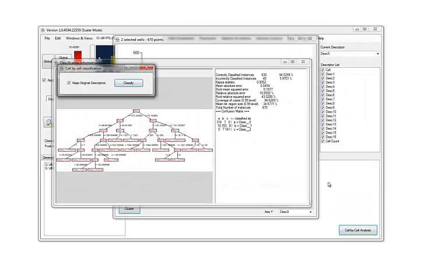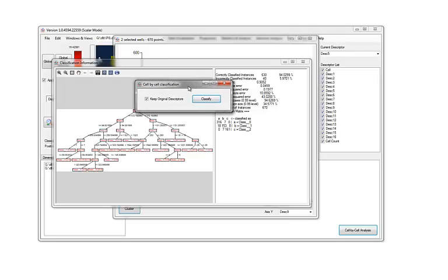This is a tree-based classification, so the learning step is giving us this tree. In this case, this tree is quite complicated, because I guess that the values do not really make sense. And then, once it's done, you can move to the classification.